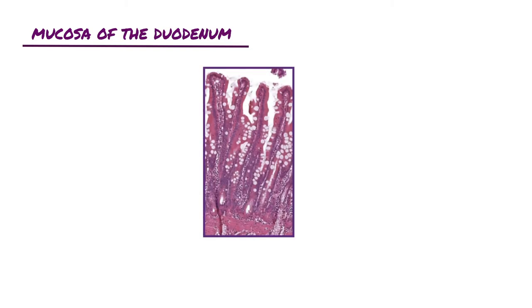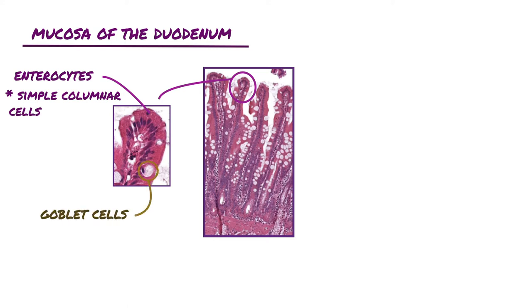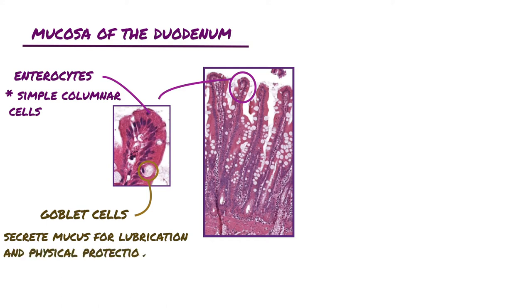Looking at the mucosa of the duodenum, densely covering the entire mucosa of the small intestine are short mucosal outgrowths called villi that project into the lumen. These finger- or leaf-like projections are covered by a simple columnar epithelium of absorptive cells called enterocytes, with many interspersed goblet cells which secrete mucus for lubrication and physical protection of the intestinal epithelium. Each villus has a core of loose connective tissue that extends from the lamina propria.